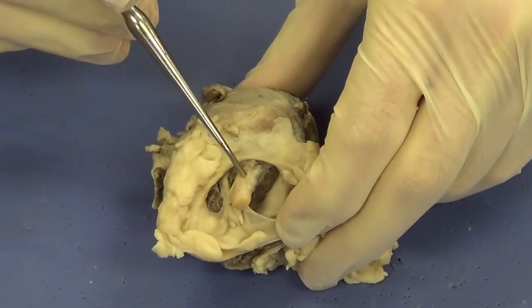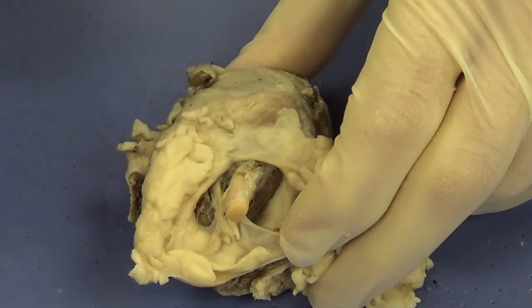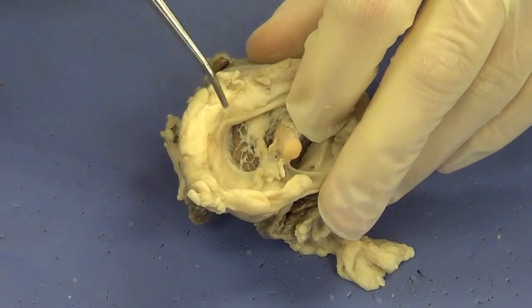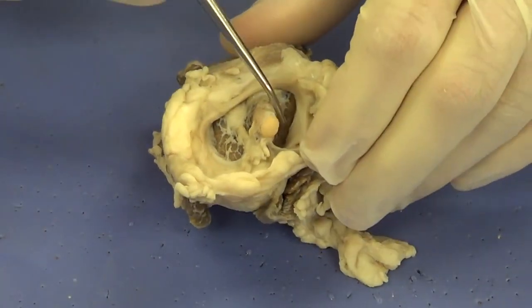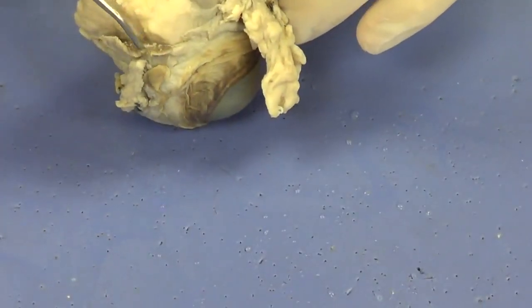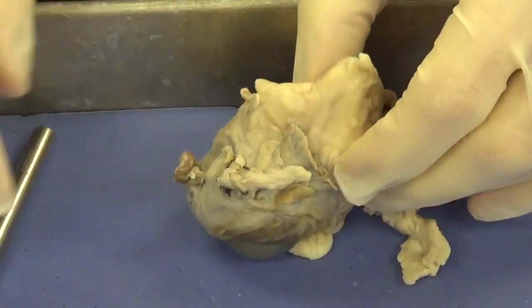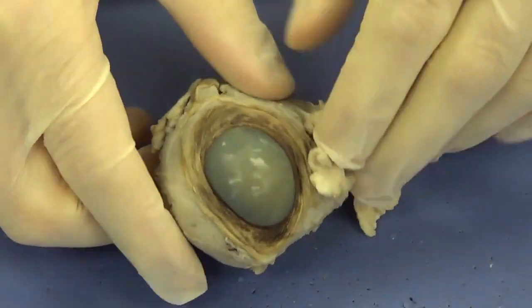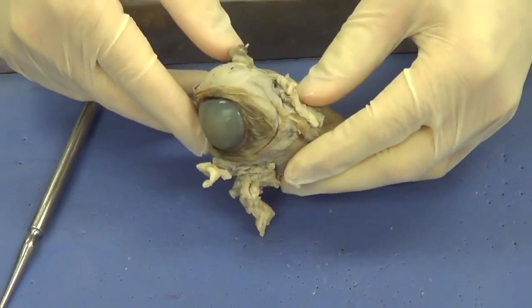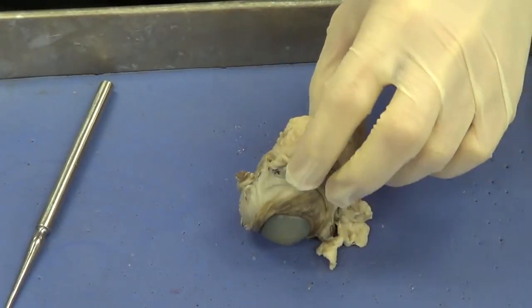Let's look at the posterior surface of the eye, and we see this long tube-like structure coming out the back of the eye. That is the optic nerve, and that will go straight to the brain. Some of the other structures that I want you to see here is just some of this brown material here. You can see a little bit of brown material over here, and you can see pieces of it here where it's been cut, and also over here a little bit. Those are eye muscles. Those allow the eye to actually move up, down, left, and right.